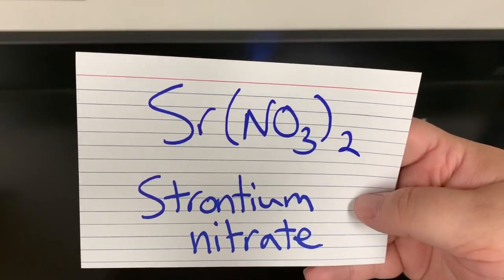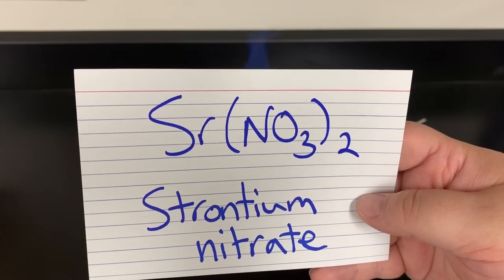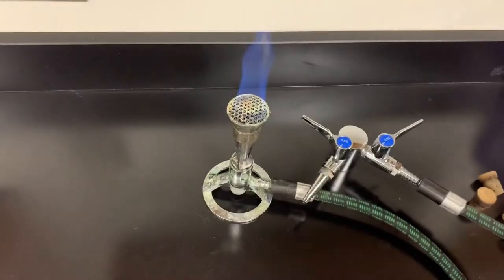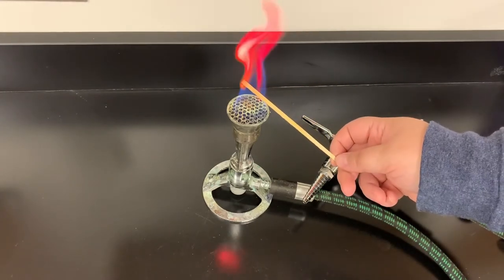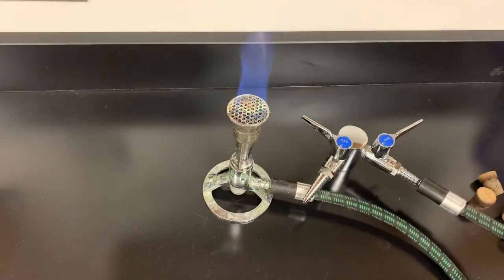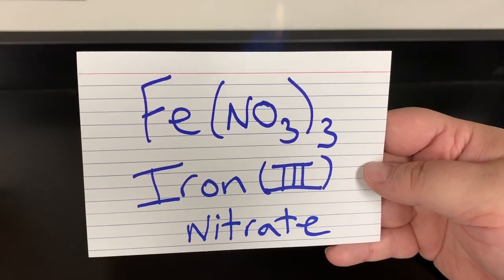Next is strontium nitrate, Sr(NO₃)₂. Strontium nitrate turns it a nice deep red color.